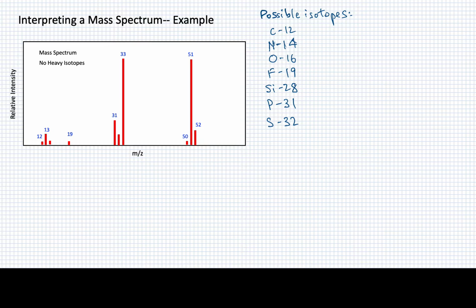In this video, we're going to demonstrate how one might go about analyzing a mass spectrum for an unknown. What I've given here is a picture of a mass spectrum that you might be given as part of this lab. We'll go through this mass spectrum and analyze it and see if we can come up with a molecular structure for a molecule that would have given rise to a mass spectrum like this. There's a couple of things that we can get immediately from looking at this diagram.